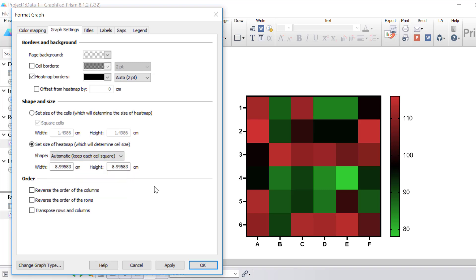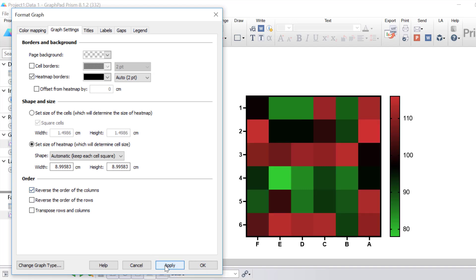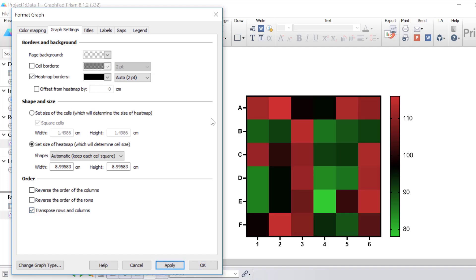At the bottom, under Order, you can optionally reverse the order of columns and rows, or transpose rows and columns. For example, if you tick the option to reverse the order of your columns and click apply, notice how the graph has shifted so that F is now on the left and A is on the right. You can do the same for rows, and if you transpose rows and columns, the columns become rows and the rows become columns.